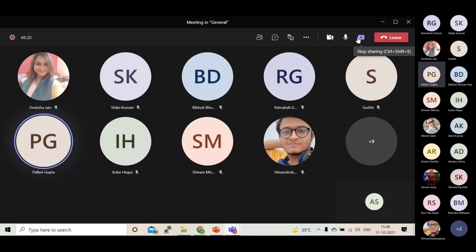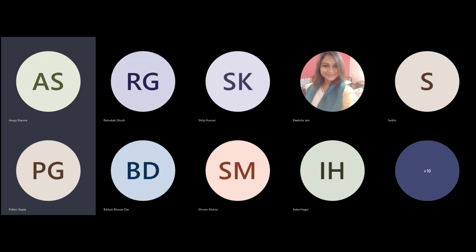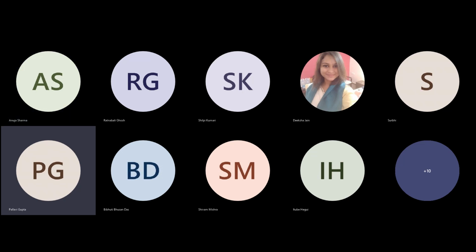Hello, I just have one doubt. I might have missed it, and maybe it was explained in one of the previous lab sessions. So here, in this case, there are lots of nucleotides between the N-terminal His tag and our gene of interest, that is the CDS. So is that not a problem, based on what exactly we want to do once we have cloned it and once the protein is expressed?